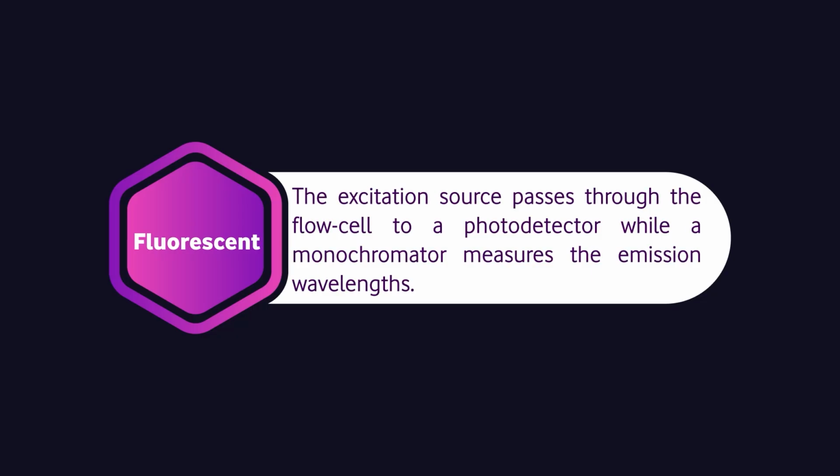What is the fluorescent property of a component? It is nothing but once the light is absorbed, this substance re-emits it. And that is the fluorescence. And that principle is used for the fluorescent detector.